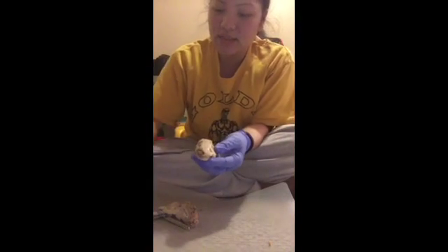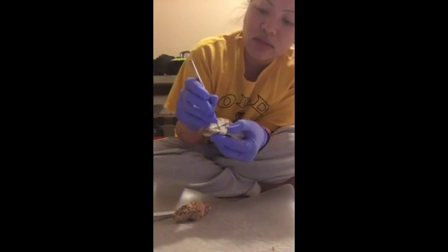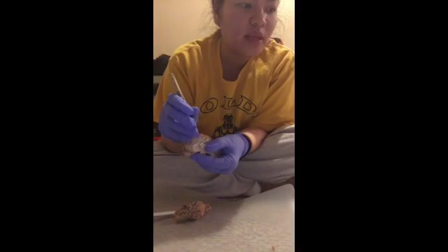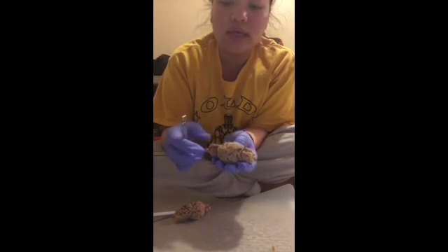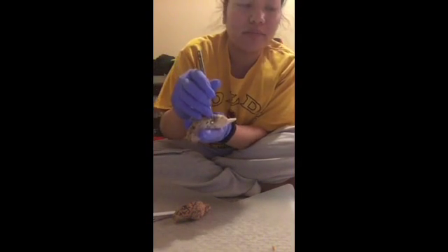The fornix is actually this one. This is the fornix right there. You can see that's the fornix. Then the lateral ventricle is this one, the big one. That's the lateral ventricle. The cerebral peduncle is right in this area, right here. It's hard to see. Right here.